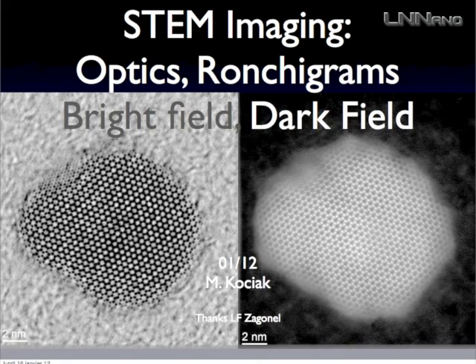So the reason why there is change in intensity is linked to thickness. So this is not platelets, in fact. This is something else. I don't know what. It has been done 1 month ago, so I cannot tell you. But the only thing I can say is that my colleague came back to his lab crying because it was not platelets. So it's one piece of information that he couldn't have had with a regular TEM for maybe 1 or 2 years. So, okay. This is just to say how powerful this can be.